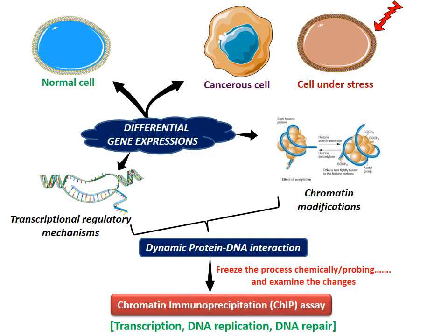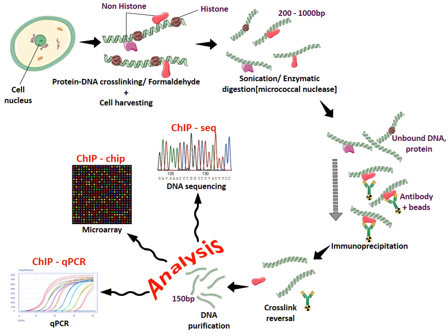The ChIP assay can therefore be also used in analyzing the binding of transcription factors, DNA replication factors, and repair proteins. So let's see how ChIP assay works. The intention is to examine the interactions of protein DNA occurring in cell nucleus.